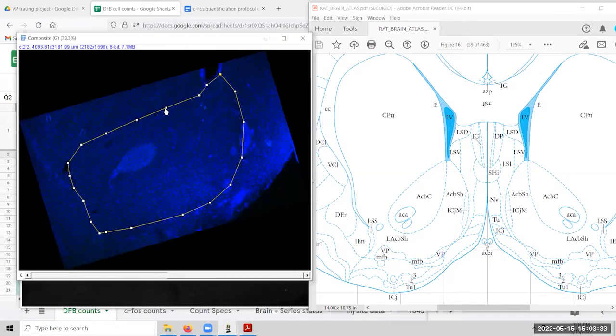So we can actually apply an adjustment to each of the vertices that we drew. That's plural for vertex. What we can do is bump things out a little bit like this, or make it a little bit more of a curve, like so. If this one reached down a little too far, we can just adjust it back slightly, like so. Same thing with this one over here. Okay, so now we have our vague drawing of the accumbens in its entirety, both core and shell being included.